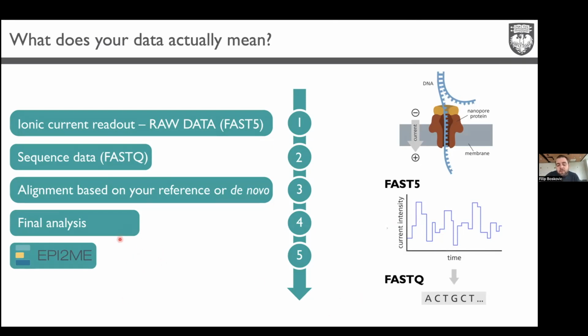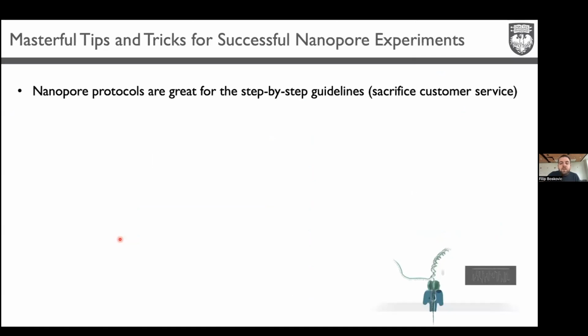However, for some more specific analysis, if you try to discover, as we do, novel RNA modifications or DNA modifications, we might need to do that more manually. But there's a lot of resources from the community on GitHub. So if you want to dig deeper into that, you can of course look on their website. They actually even take all the people who create some algorithm, check it, and put it on the website.